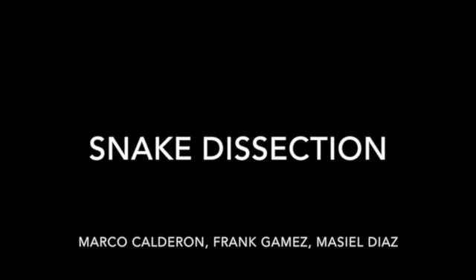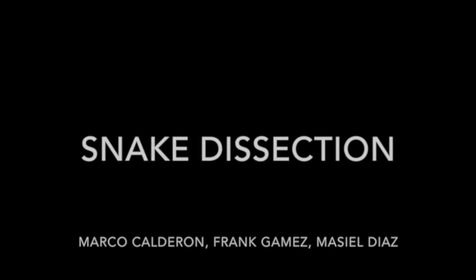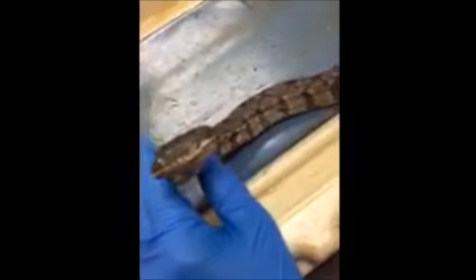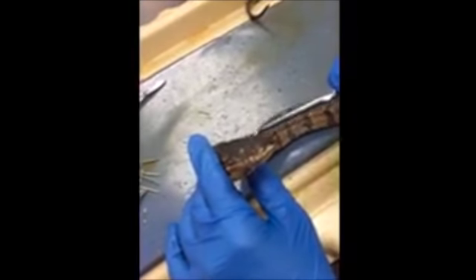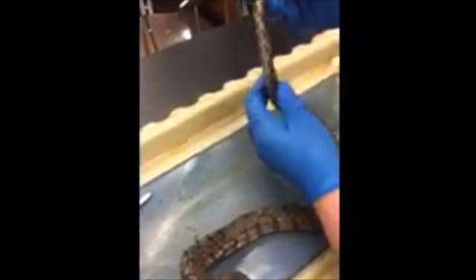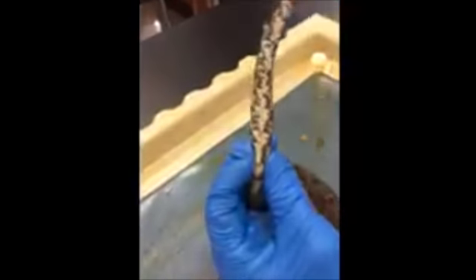We're dissecting a snake today. Right now we're going to go over the external structures of the snake. Right here we can see the eye and the mouth. And we can also see the cloaca, which is the urinary and reproductive opening of the snake. Right there.